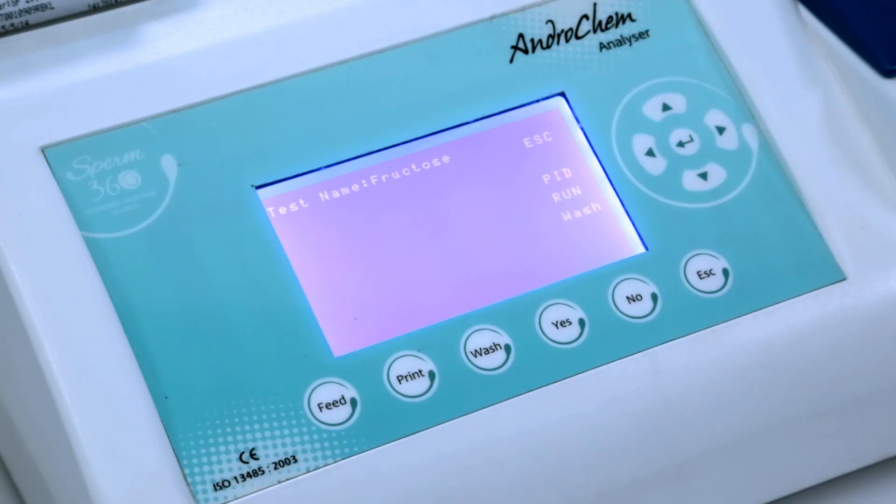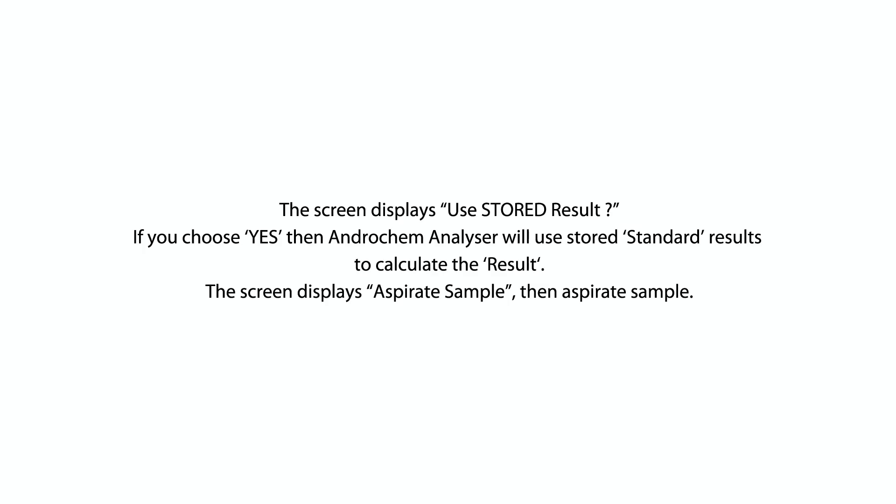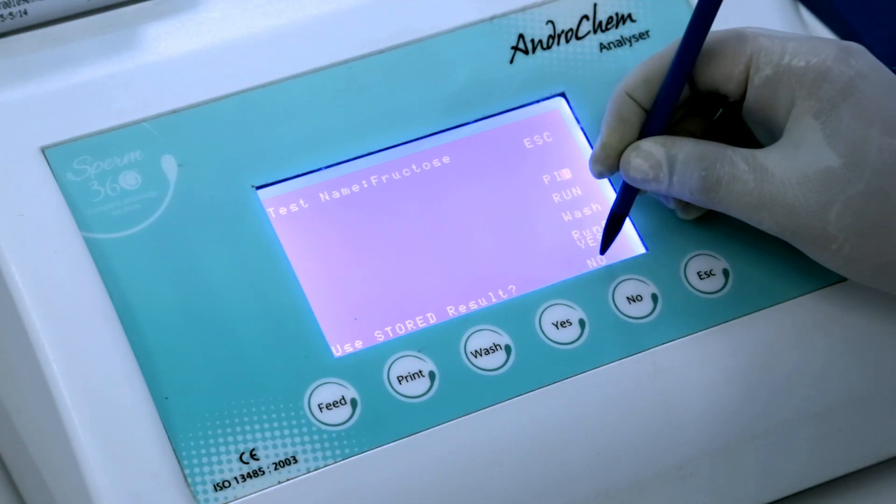The screen displays Use Stored Results, Yes or No. Choose No.